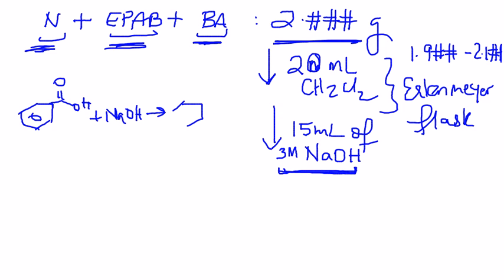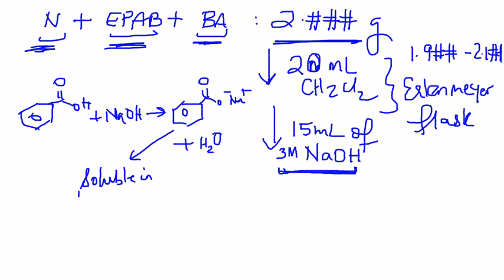it's going to give you sodium benzoate and water. So sodium benzoate is similar to sodium chloride. That's a salt now. It's a polar compound. That would be soluble in water. So in this process, what have we done? Using this acid-base chemistry, we have essentially pulled the benzoic acid in its soluble salt form into the aqueous layer.